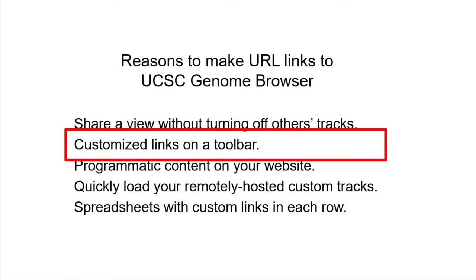You may wish to have some links in your bookmarks to key places in the genome. Because URLs tend to be additive, if you have data tracks turned on and click a link that simply points to some gene, the links we describe here can be designed to go to the other location, leaving all other datasets in your display in the same configuration. Any datasets you add to the link will be added to whatever setup you already have.